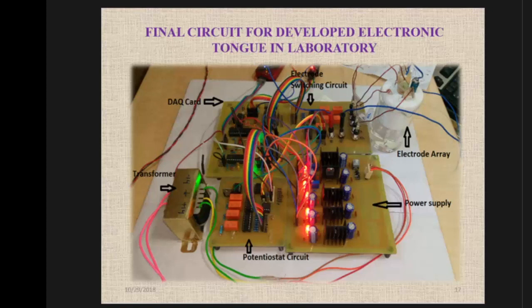One of the reviewers raised a question: why is the power supply module so big? Yes, it is big because we are trying to right now use a linear power supply, and also the 5 volt, plus minus 15 volt, 12 volts, all those different types of power supplies are there. So we decided not to go with the chopper mechanism of generating the power supply, because that introduces some high frequency noises. So we decided to go on with the linear power supply.